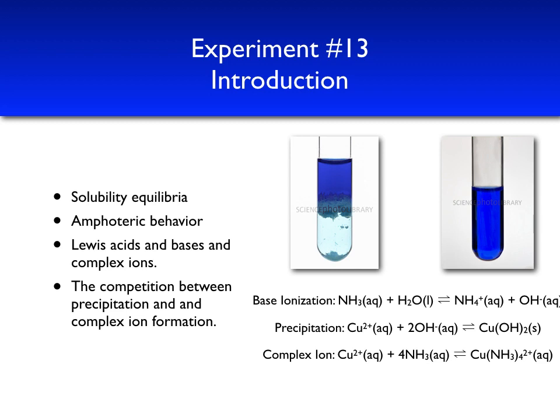However, when an excess amount of ammonia is added, then a complex ion forms between copper 2 plus and the ammonia molecules. The observation that this complex ion is forming is the color change from a light aqua blue color to a deep royal blue color, which can be seen in the right-hand picture. We will see a lot of these types of transformations as we carry out the reactions in part 1 of this experiment.